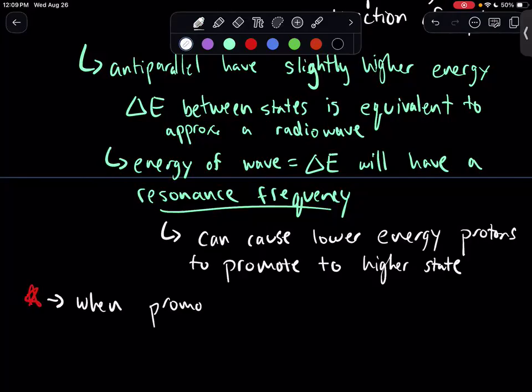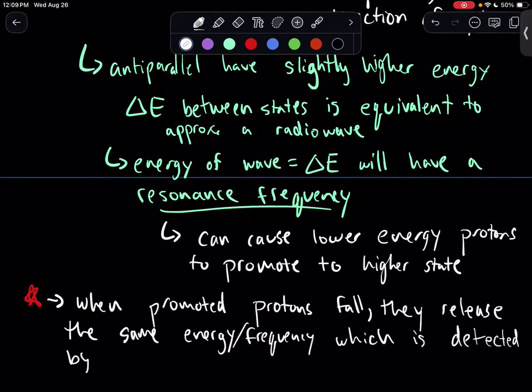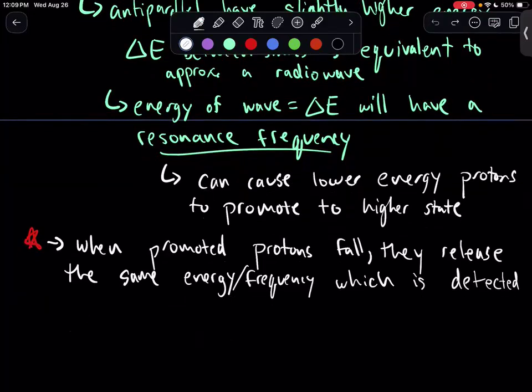When promoted protons fall, they release the same energy or same frequency, seeing as these are related, which is detected by our detectors, which creates a spectrum that we can then analyze.